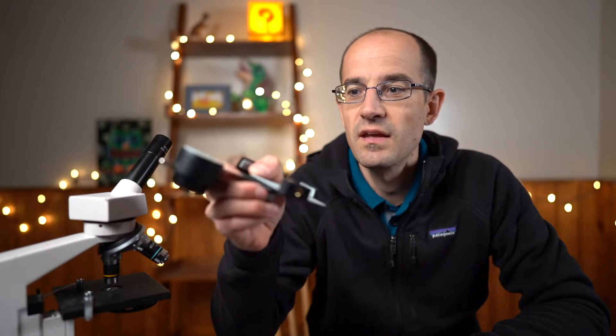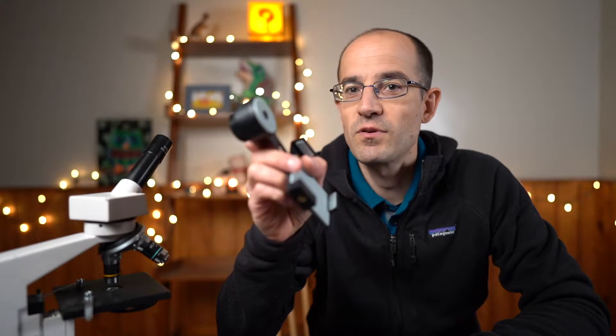I am going to be using a little adapter for my cell phone underneath the microscope, so you will be able to see exactly what it is that I see. I hope you will be just as amazed by the cheek cells as I was the first time that I witnessed them. So let's get working on it.